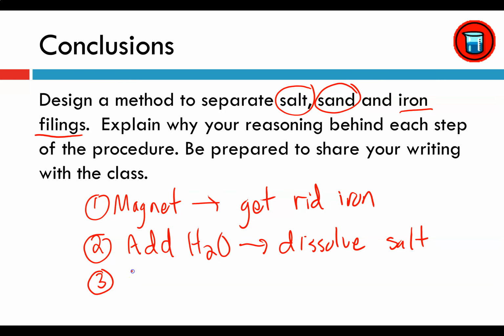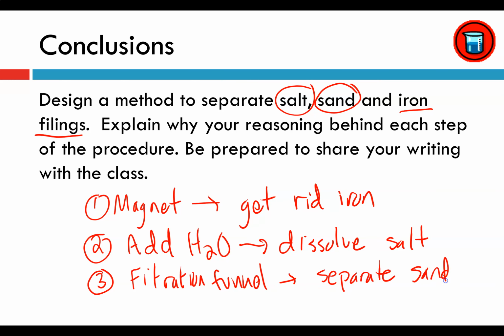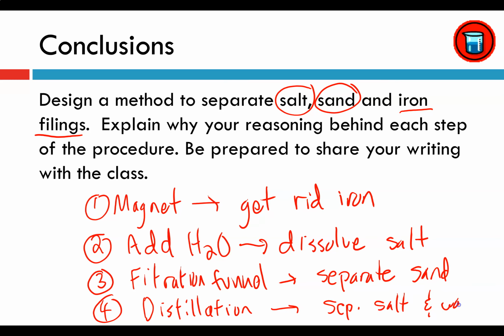Then I can use the filtration funnel. That will separate out the sand. It will get stuck to the filter paper, and the salt water will pass through. And then last but not least, we can use the distillation apparatus. Distillation. And we can separate the salt and water.